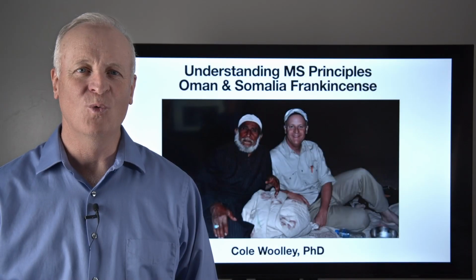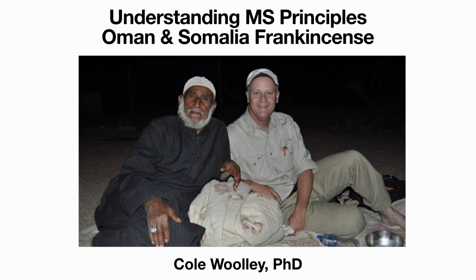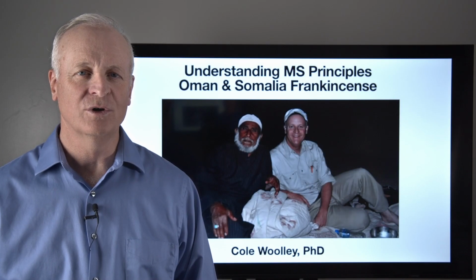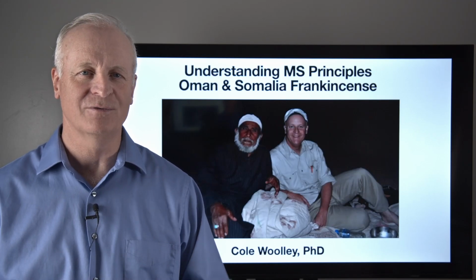Hello, this is Dr. Cole Woolley, and this lesson is called Understanding MS Principles. This is all about using the GCMS in order to differentiate between Oman frankincense and Somalia frankincense.